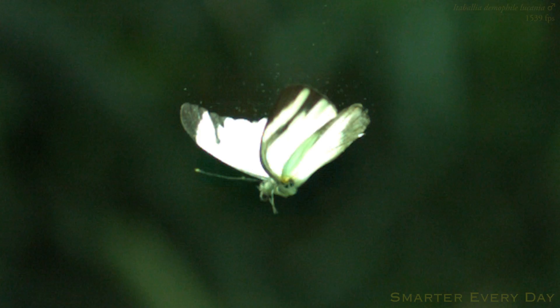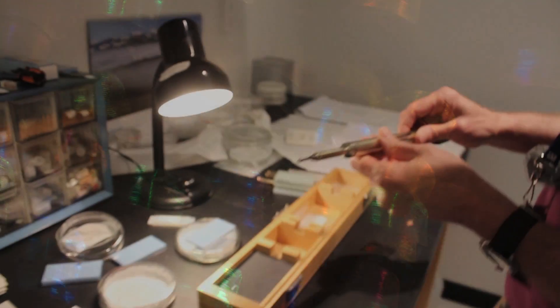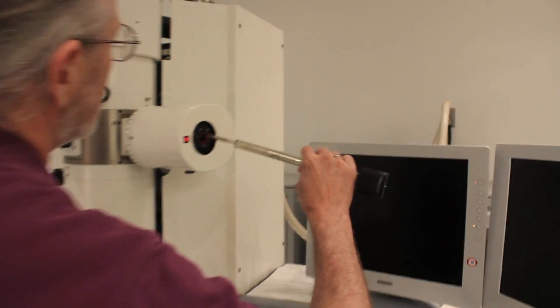So if you watched the last episode, you're aware that these little dust particles are actually scales coming off the butterfly's wings. What we don't know, however, is how are those scales attached to the wing in the first place. Dr. Simmons happens to be an expert microscopist and he's agreed to give us a little lesson in scanning electron microscopes.